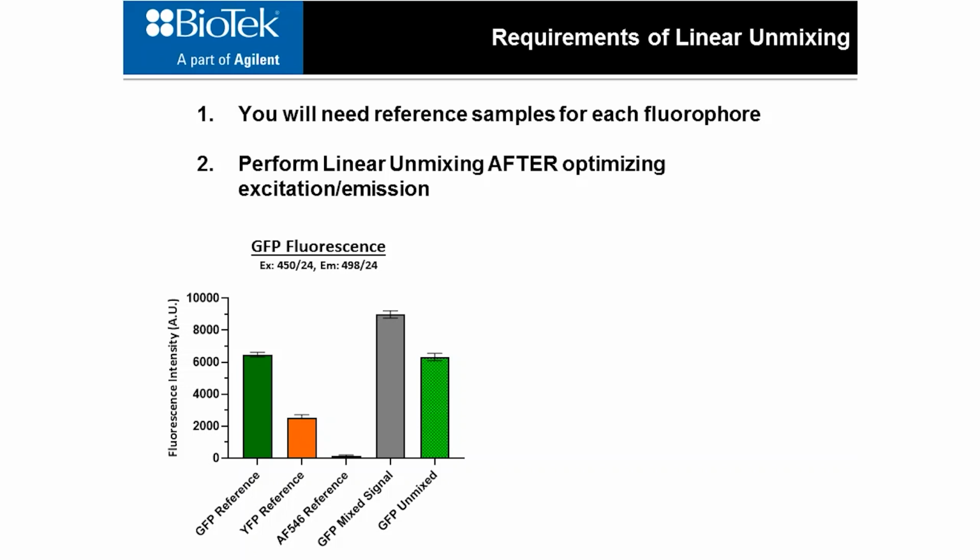However, if you were to mix them in some proportion, as in the gray bar, what you can see is it's difficult to decipher. However, once you establish a standard curve based on your references, you can unmix the GFP signal even when multiple fluorophores are present.